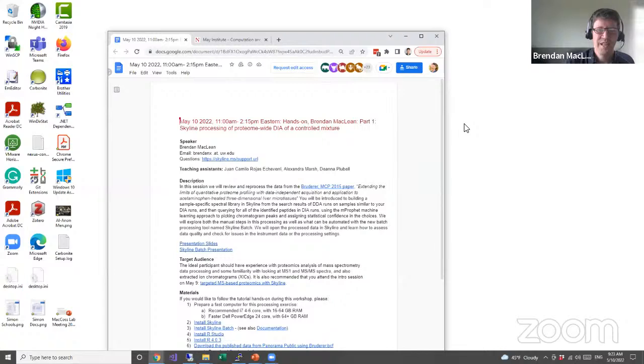Okay, so Deanna is handling that one. For the replicate same precursors, how to sum them up for quantification. For the DDA data where we're doing precursor quantification, and we've extracted the monoisotopic, the M+1 and the M+2, so we've got 3 isotopes extracted. In the absence of interference, the more ions you measure, the better. So if you measured a bunch of ions and you're confident there's no interference, you should include those in your statistical quantitative assessment. So add the peak areas up.